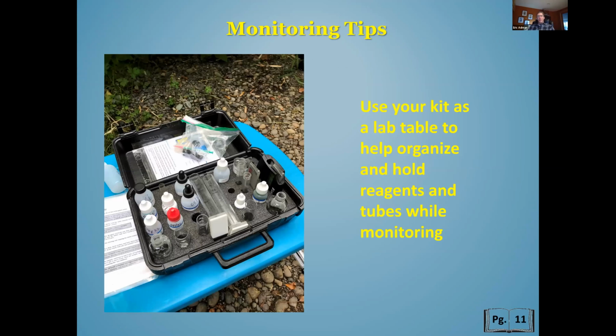Another tip is that while you're doing your monitoring, it helps to keep things organized. And so you can use the kit itself as you do your tests to hold the bottles, the reagents, the tubes, so that they don't tip over, cause you to have to start your test over again.